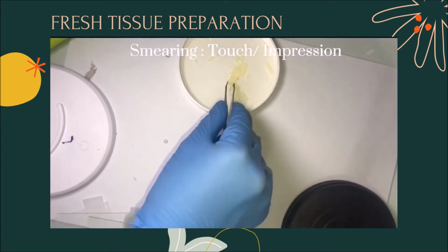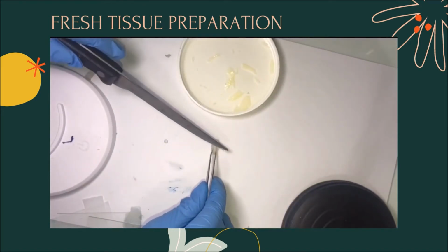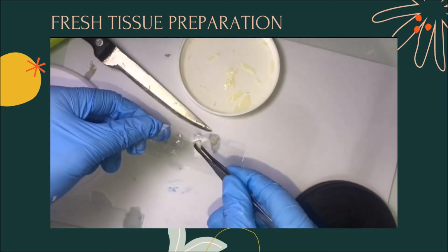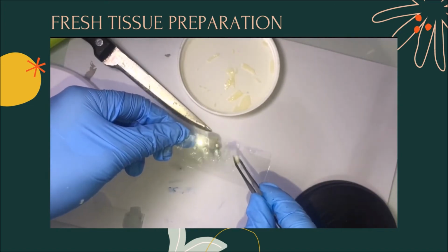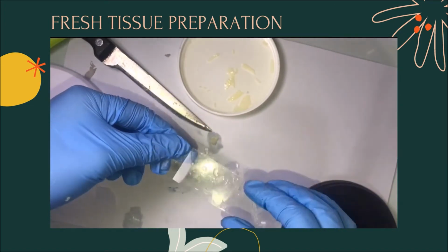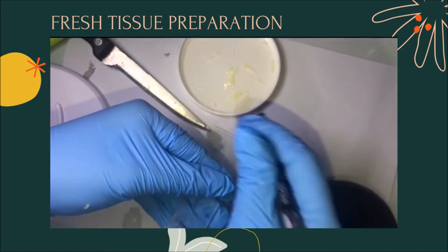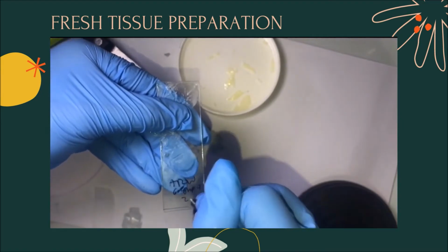For the last process, we have touch or impression smear. Retrieve the block of tissue from the first procedure and cut the block in half, exposing a fresher surface. Then, allow the freshly cut surface to come in contact with the surface of a clean glass slide. Apply gentle pressure, allowing the cells to be transferred directly to the slide. Cover the smear with a cover slip. Afterwards, don't forget to label.